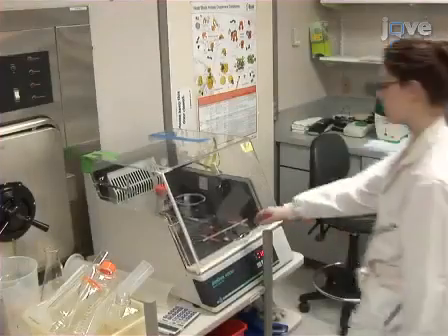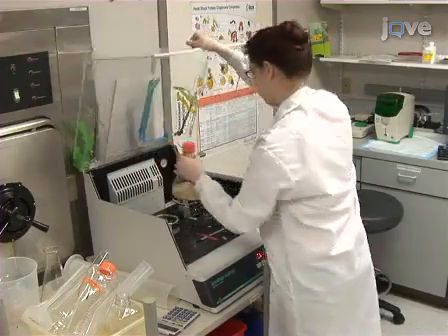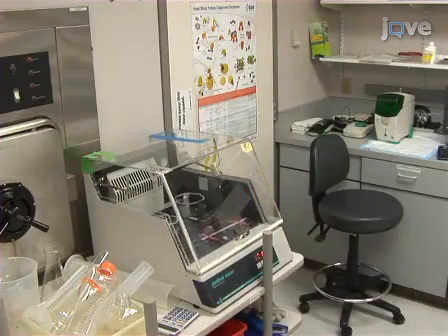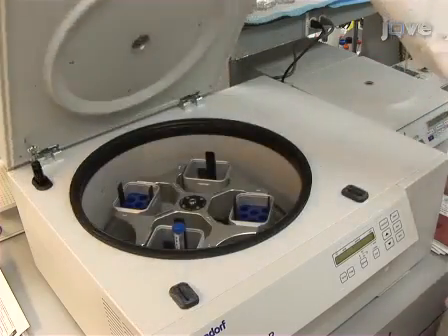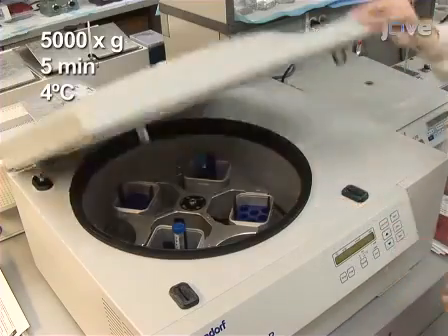To isolate functional glucocorticoid receptor, or GR, grow mouse fibroblast L929 cells, or SF9 cells that have been infected with recombinant GR baculovirus and are in the exponential growth phase. Centrifuge the cell suspension at 5000 g's for 5 minutes at 4 degrees Celsius.